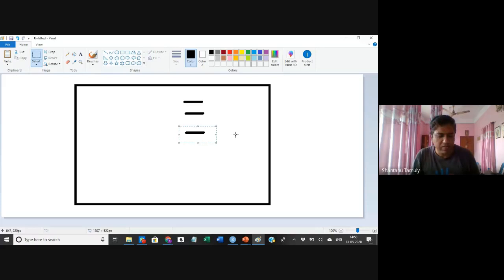Likewise, you have these proteins, and along with this test protein, you have run it from the well. From the well, you loaded your sample, and then the proteins were separated, or DNA, they were separated. So along with your test protein or test DNA, you also should run one standard marker.